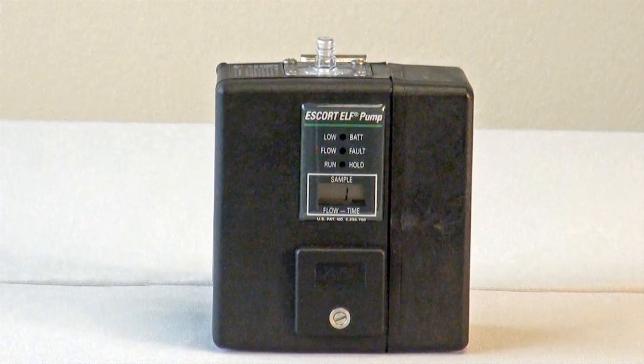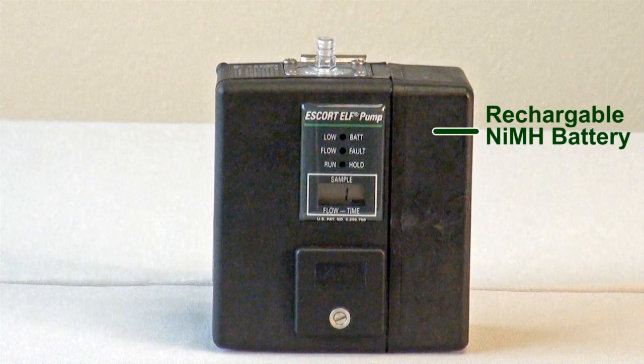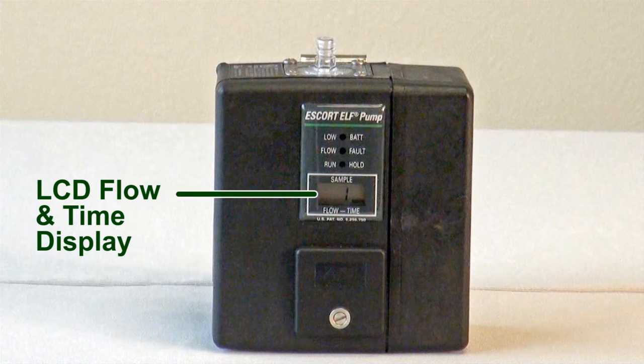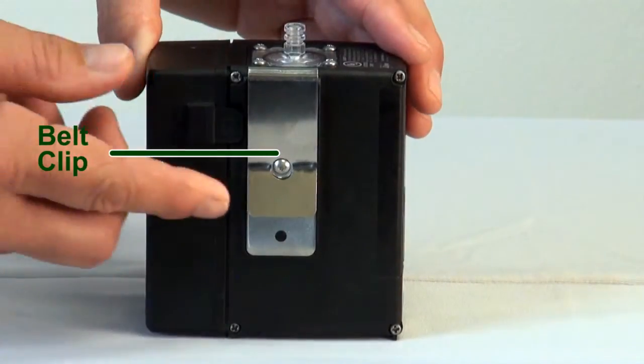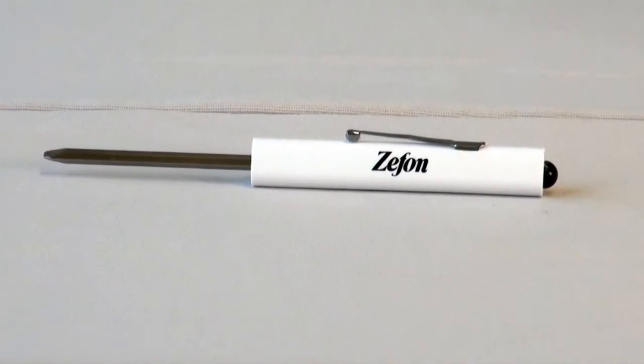Let's begin with a brief description of some of the key parts of the Escort Elf Pump: Inlet Cover, Rechargeable Nickel Metal Hydride Battery, LED Indicator Lights, LCD Flow and Time Display, Switch Cover, Control Buttons, Belt Clip, Battery Charging Jack, and Zeffon Reversible Screwdriver.